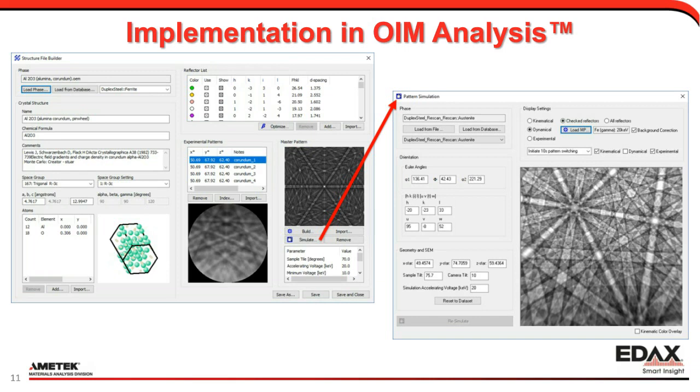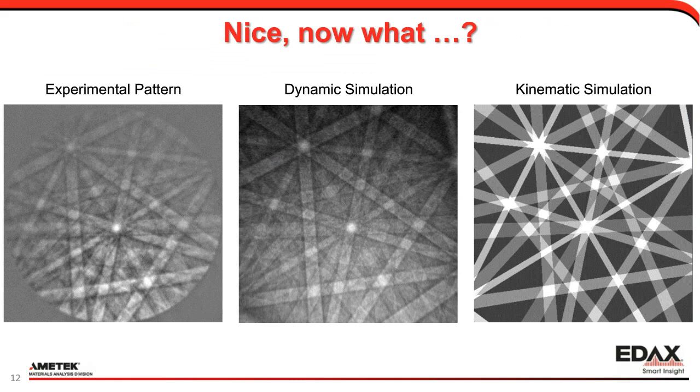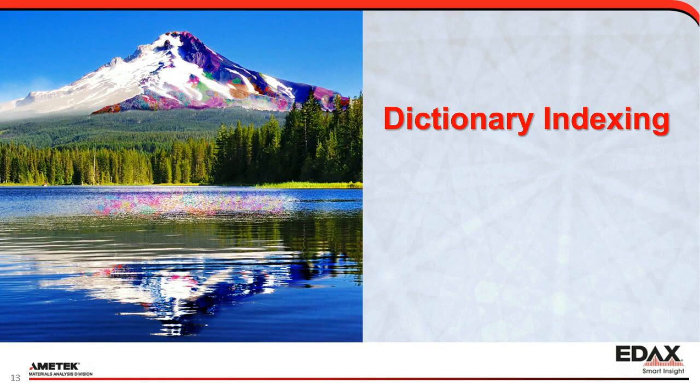So that's very nice, but there's more to it than just being able to compare patterns by eye. So let's look at some of the things we can do with these simulated patterns. We'll first focus on dictionary indexing.